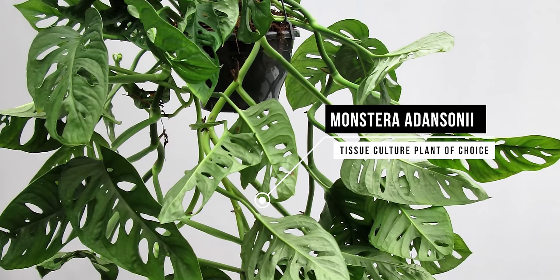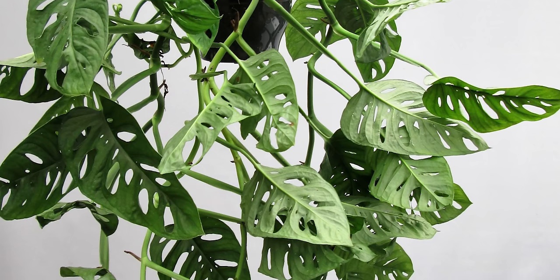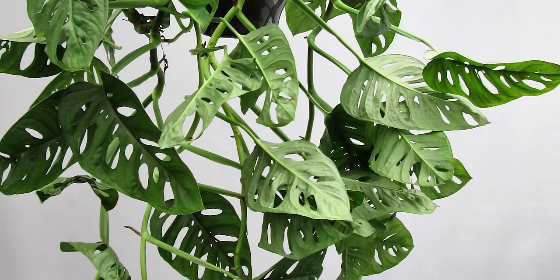Basically, I own a Monstera obliqua, and I am not about to screw around with really expensive plant material when I can actually experiment with the protocol on plant material that is much cheaper to find. So that is why I'm actually using Monstera adansonii.